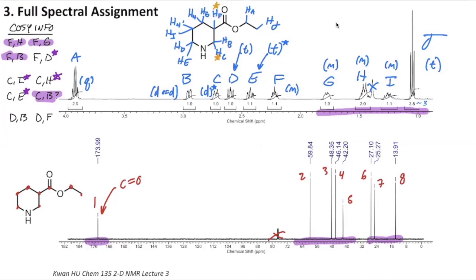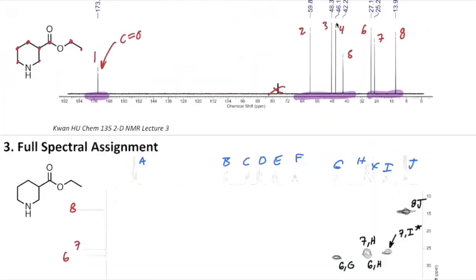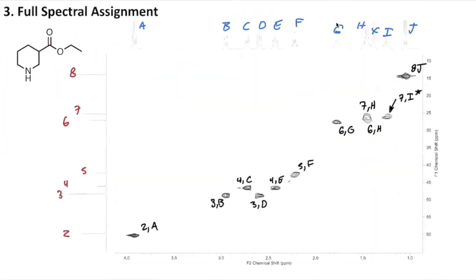We might be able to swap them, but I think we can use our other piece of data to help us figure it out a little bit more clearly, and that is our HSQC. So let's pop down to the HSQC and think about the carbon-hydrogen correlations. In fact, this maybe would have been the fastest way to do it, to look here first. I wanted to take that chemical shift approach of getting some assignments in and then coming back to them later. If you prefer to work in that way, where you're looking mostly at the protons and then at the COSY and then at the carbon, that's fine. If you want to be looking back and forth between all the pieces of data all the time, that's good too.